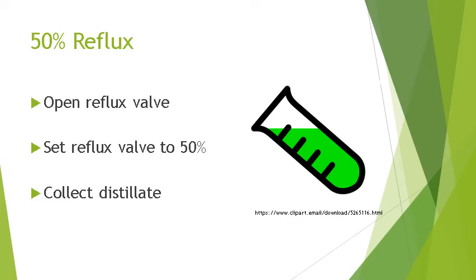You should have collected about 100 to 150 milliliters. Do not collect more than this, as there could be too much ethanol leaving your system. Also, do not discard the distillate. Once it is cooled, it will be returned back to the system.